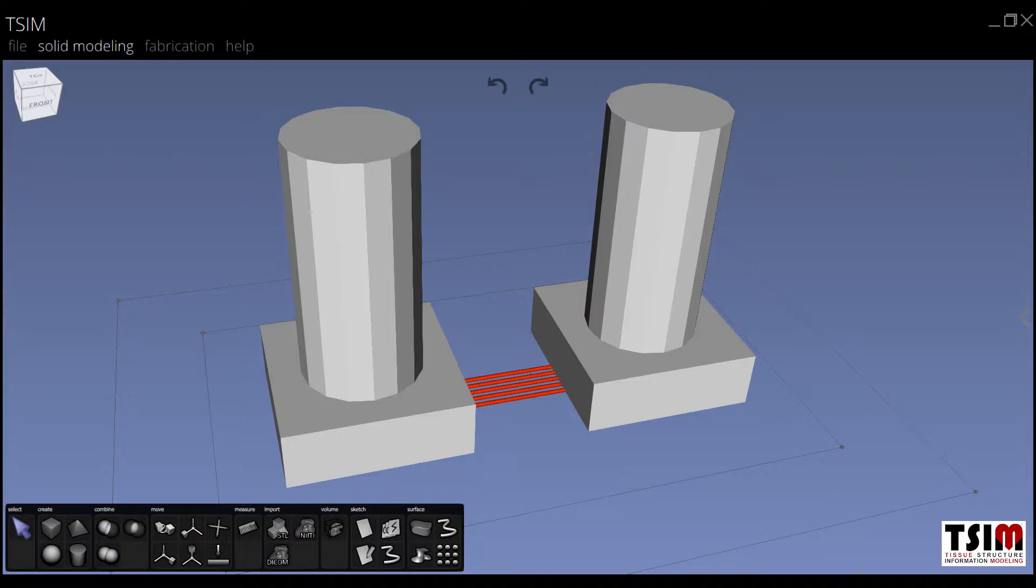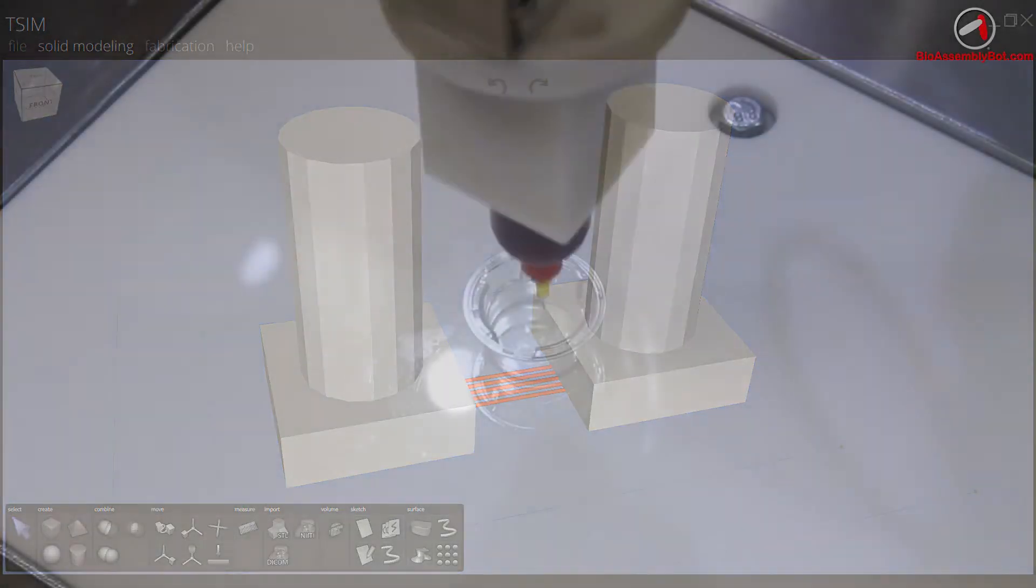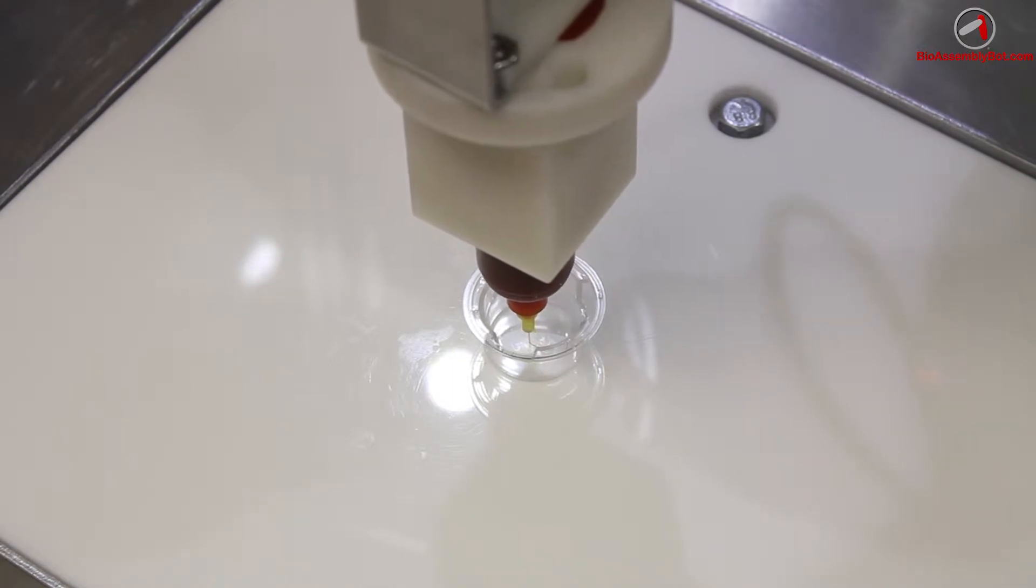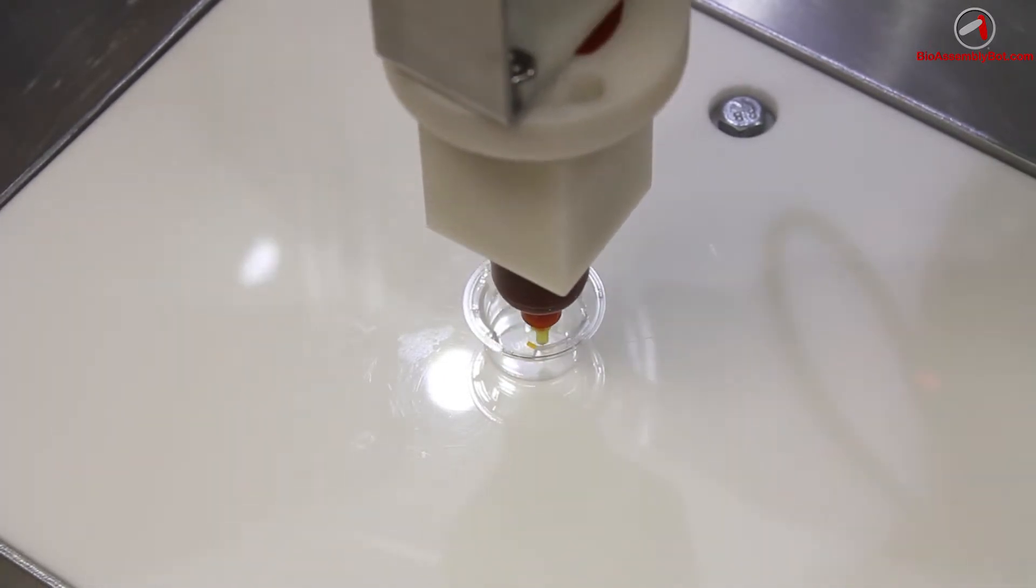In TSIM, once it's finished, the construct is sent to the VAB bioprinter, which is first instructed to print the five parallel microfluidic channels of sacrificial material. In this case, pleuronic hydrogel.